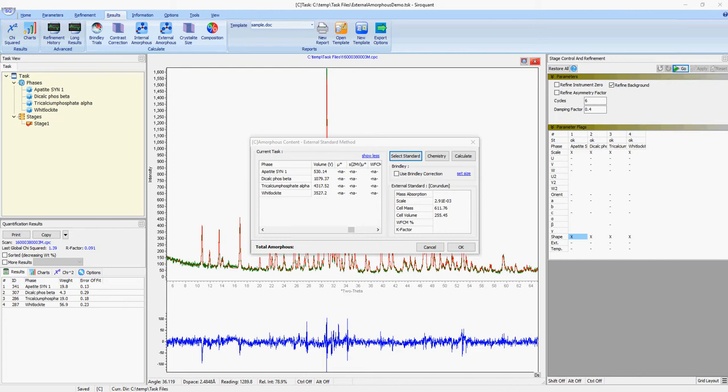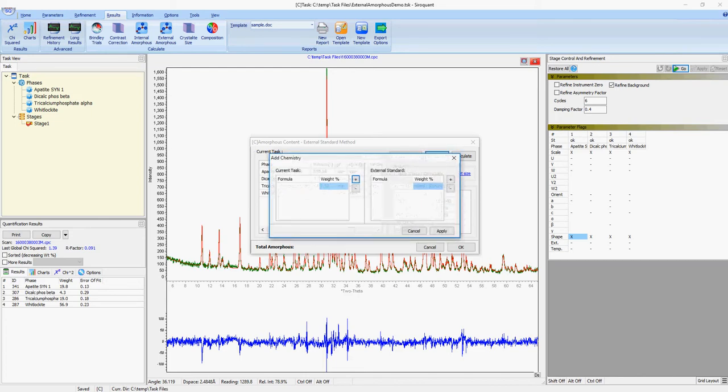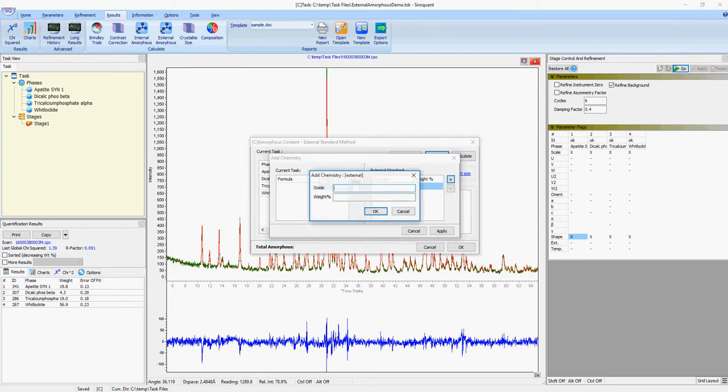The next step is to either enter the mass absorption coefficient or the chemistry for both the standard file and the current task. This can be done using the chemistry entry box by entering the oxide and weight percentage.